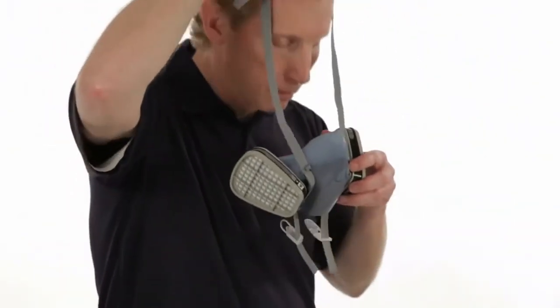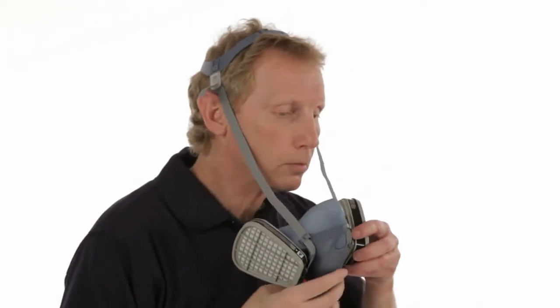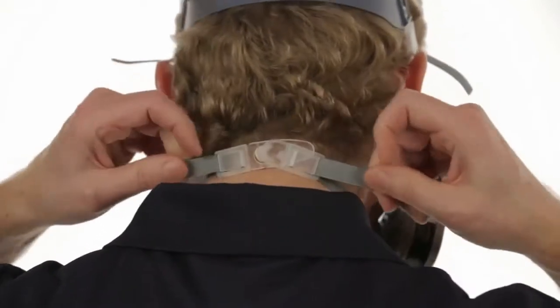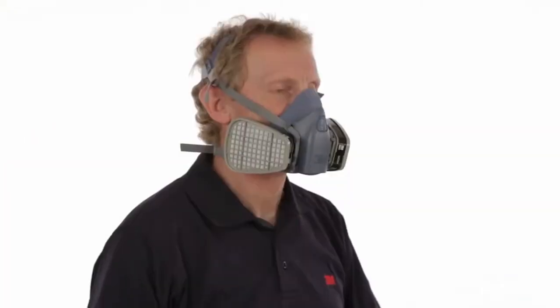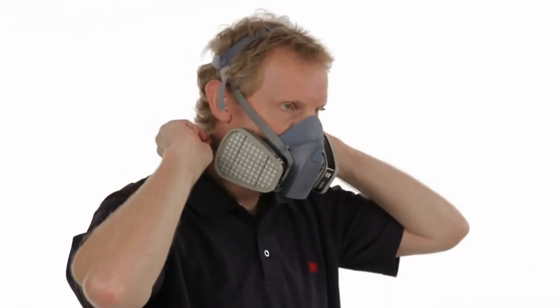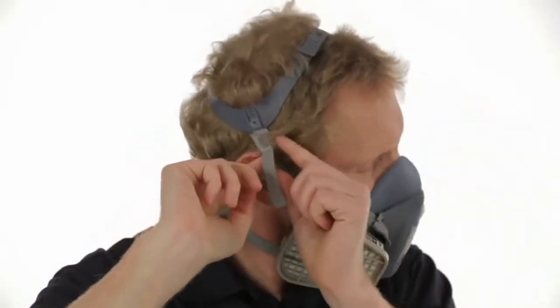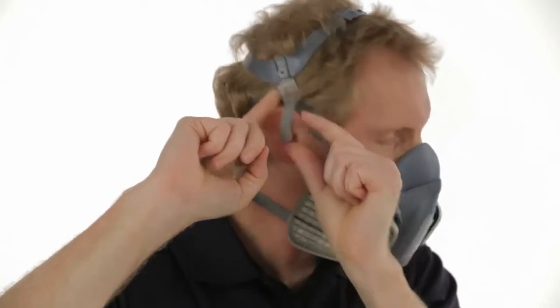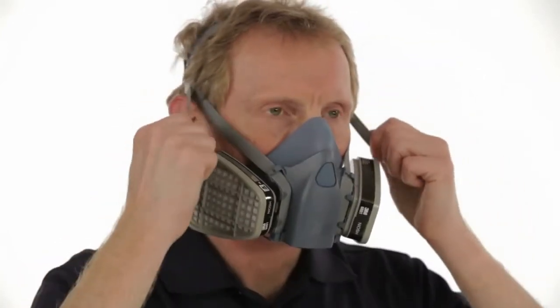While holding the head harness strap ends with one hand, slide the facepiece up onto your face. Grasp the ends of the straps with each hand and hook them together at the back of the neck. Tighten the straps by pulling on the ends, top straps first, then bottom, until the respirator fits securely but comfortably. Balance strap tension by adjusting at top and bottom strap buckles. Do not over-tighten. If the straps are too tight, push out on the back of the buckles to loosen.